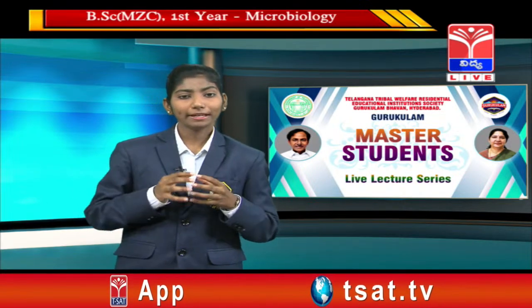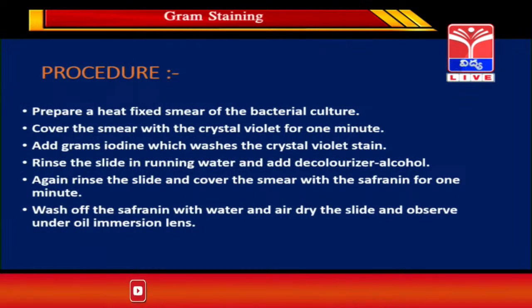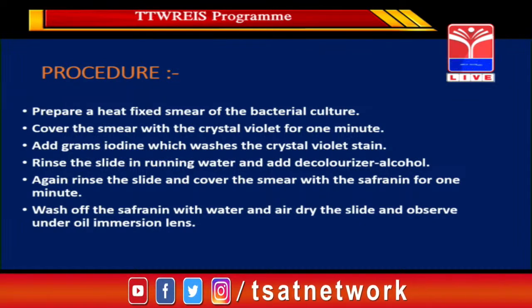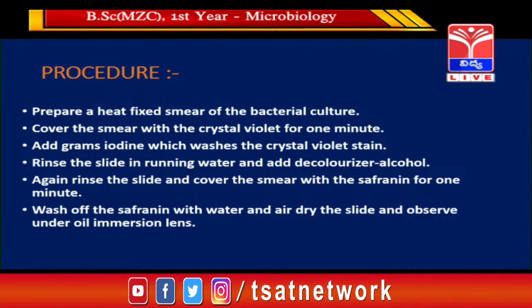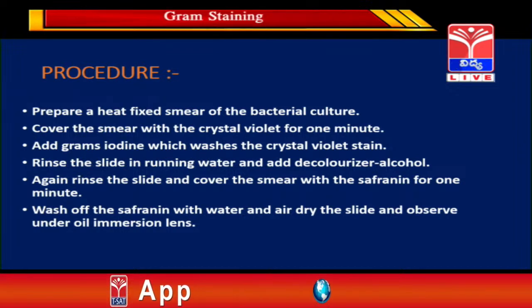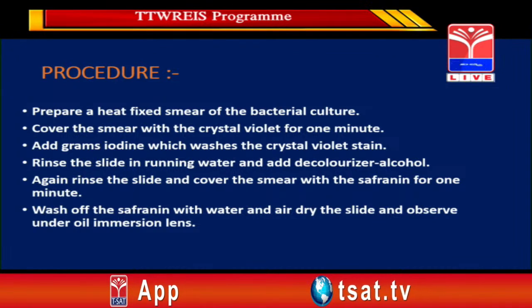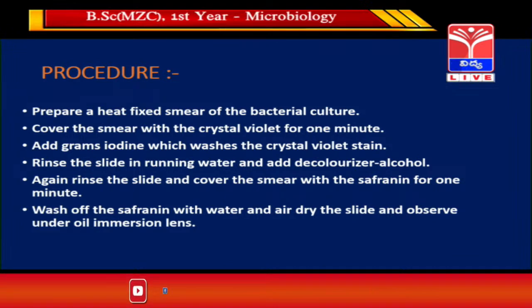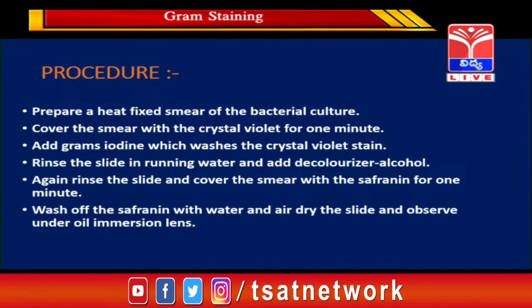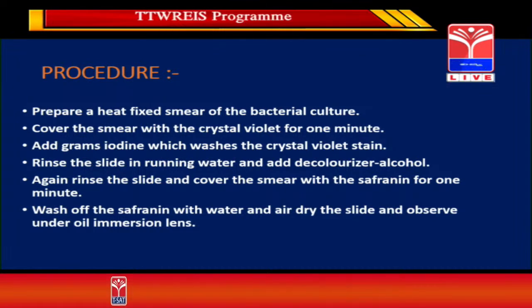So, prepare a heat fixed smear of bacterial culture. Okay friends, here what is meant by culture? Yes, culture means cultivating of microorganisms. So, cultivating of microorganisms is termed as culture. Preparation of culture is done only under flame, because this flame can prevent the contamination of other microorganisms when we perform this procedure.